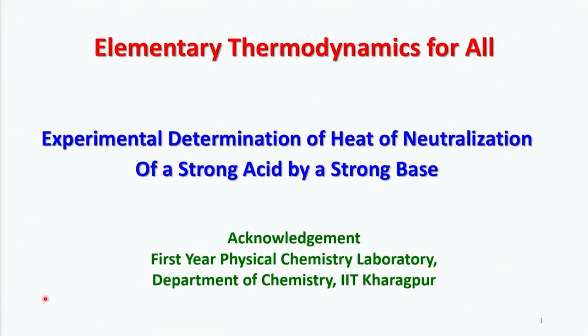Hello students. In today's class, we are going to actually look at an experiment in which a thermodynamically relevant quantity is being measured. So, the topic of today's lecture is experimental determination of the heat of neutralization of a strong acid by a strong base. And I am going to show you some actual experimental procedure by which this enthalpy of neutralization is being determined. So, let us go ahead and have a look.